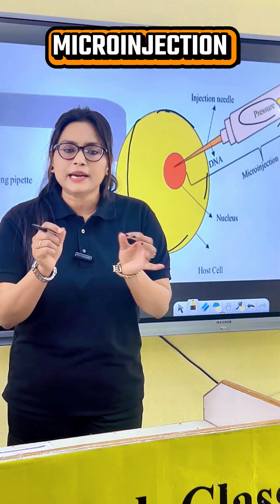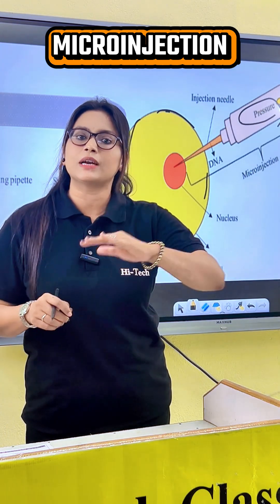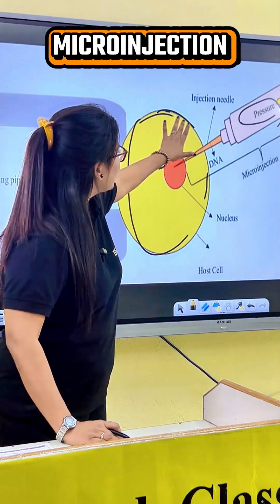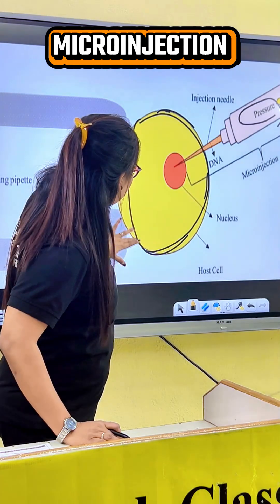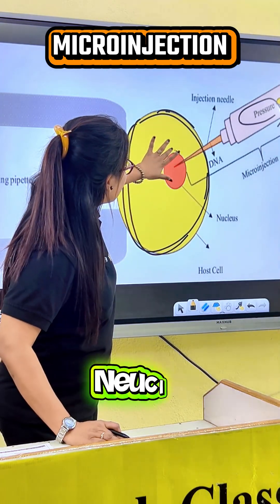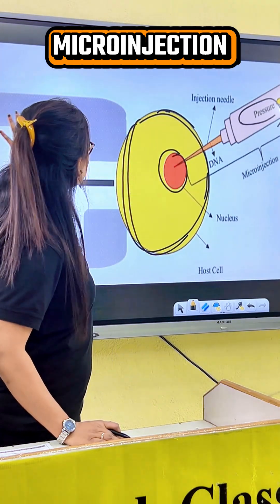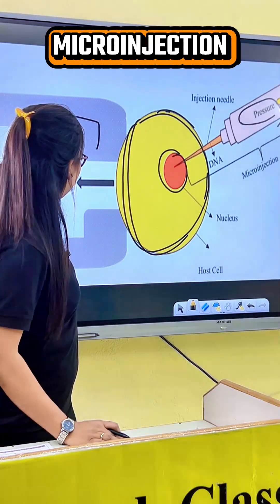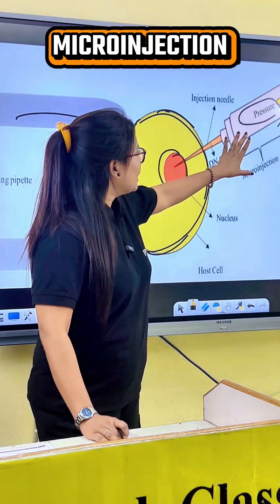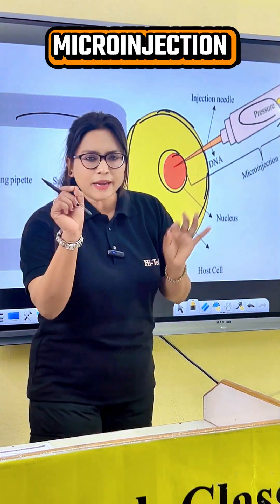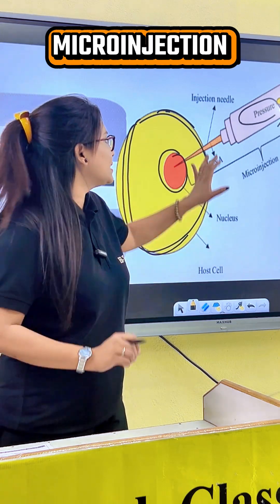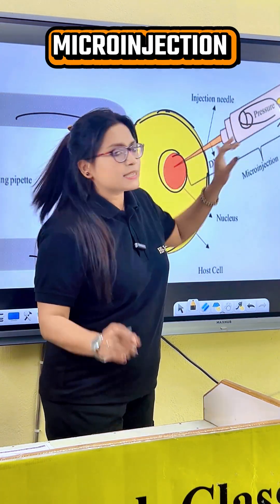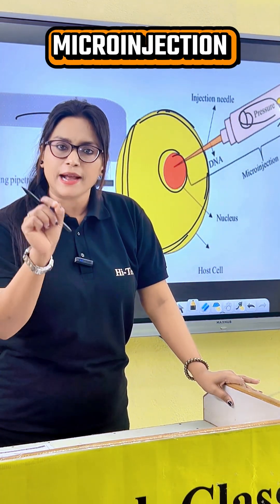We directly transfer the DNA to the target. Look here — this is the cell, and inside this is the nucleus. The cell is held with a holding pipette, and a fine glass microneedle is used. Here we are loading the DNA sample which is to be transferred to the target site.